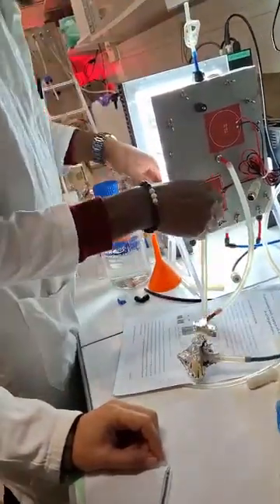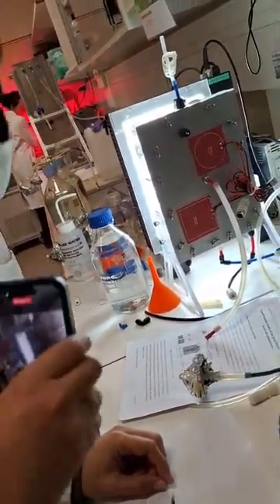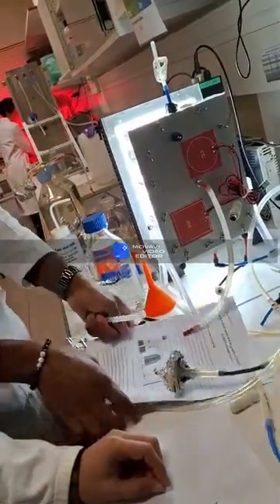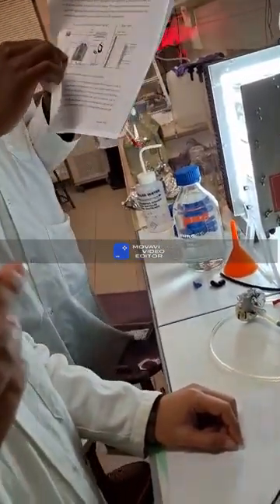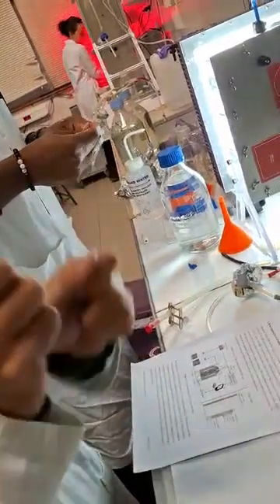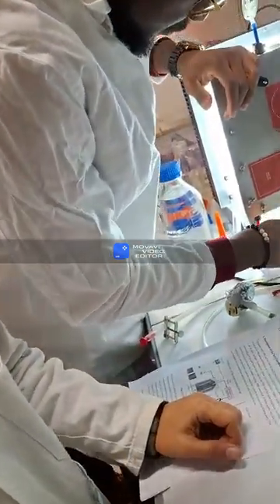So one of them is inlet and the other one is outlet? No, just the inlet. So why do we have two of these? Because inside here you have a convection movement inside the culture. For mixing, you know. You have a magnet, but beside that you have air supply, it means it will help to mix well. Hydrodynamics. Exactly. So one is for air and one is for carbon dioxide, and we will mix it inside.